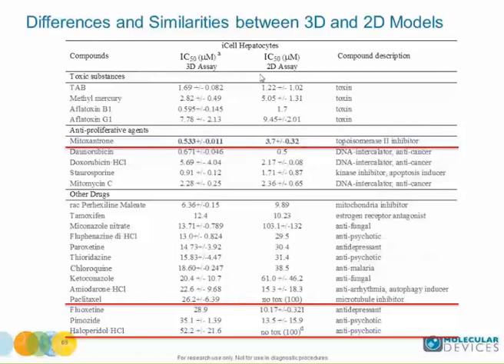You can see some notable differences in IC50s for several compounds, while other IC50 values are not significantly different. We need to reiterate that exposure time was 72 hours, which is acute exposure, and there is a possibility that longer term culturing may cause more differences.